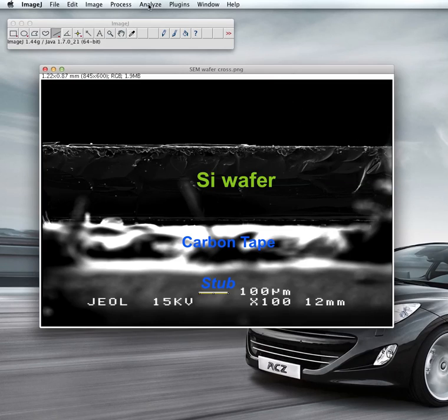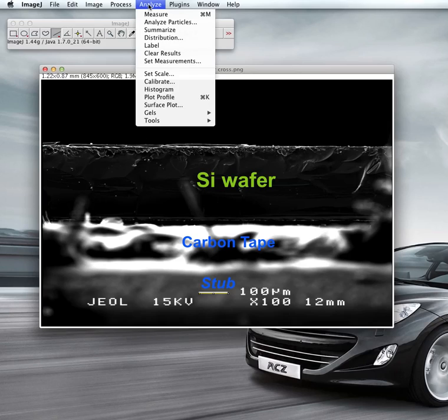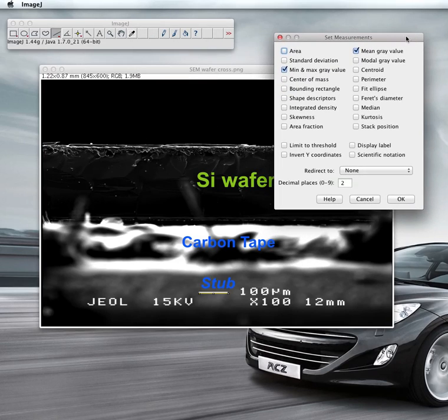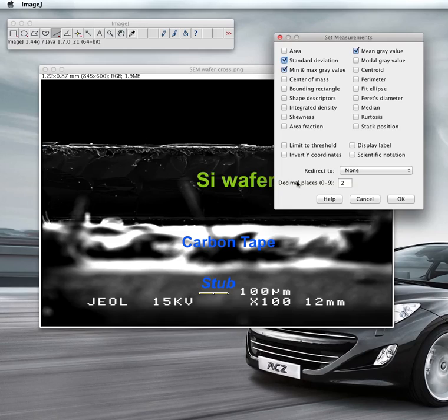Next step: go to Analyze again, and then Set Measurements. Select the measurements you want — I'll set area, standard deviation, and center of mass. For decimal places, I'll set three decimal places, then click OK.